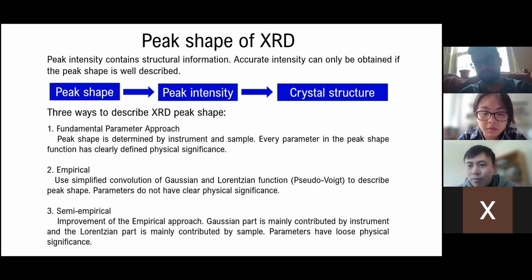That's related by the mathematical definition. And if you have a high flux, then we have a much better signal to noise ratio at high Q. Maybe there are also some other details about intensity, but we'll just move to the peak profile.